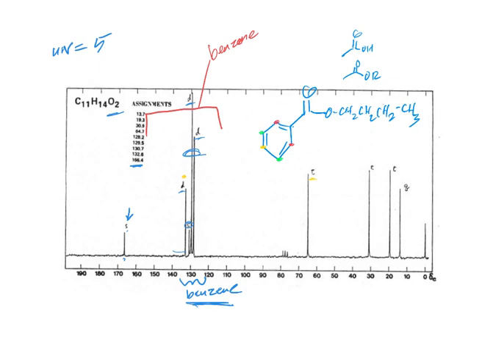So my follow-up question is, if you were to insert a CH2 in between the benzene and the ester, that would be more upfield than like 30 ppm, correct? So if you had a CH2 in here, yeah, actually, I'm not sure exactly where that would be. Putting alkyl groups next to benzenes and next to carbonyls doesn't shift them downfield as much as you would think. Yeah. I think the things that we might look at here is, well, even that isn't that far off.